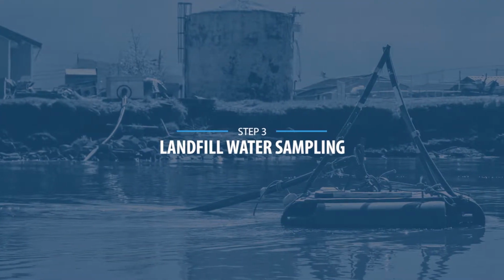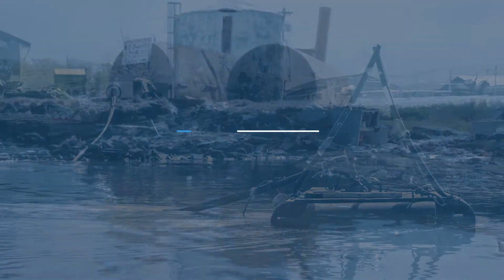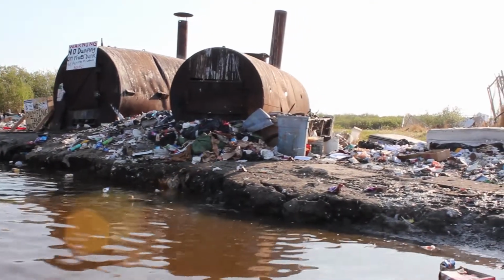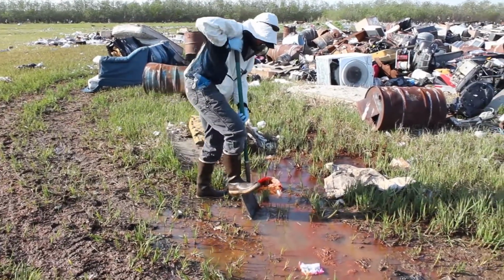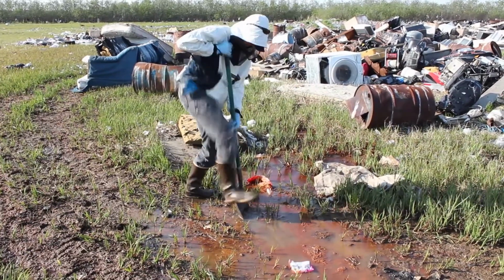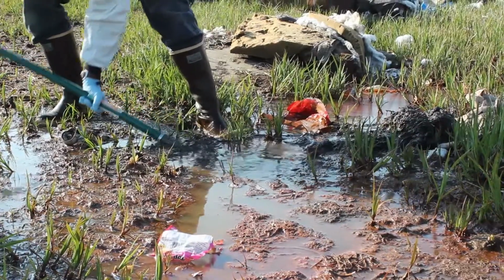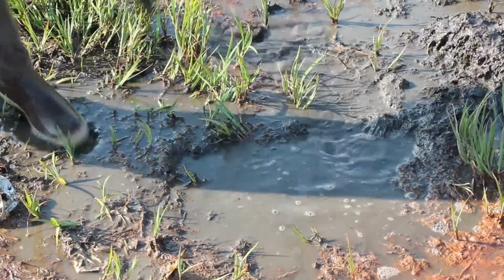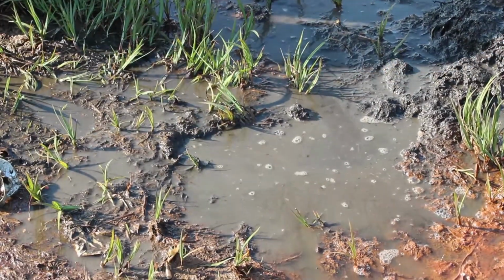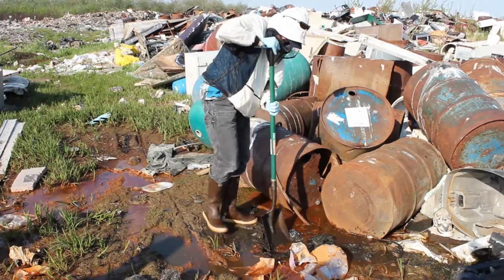Step 3. Landfill water sampling. Once you're back at the landfill, it's time to take your samples. If any of the sample sites are too shallow, you can dig a hole to make them deeper. Of course, this will stir up some sediment, so let the water settle for a while before taking the sample at that location. You might have to repeat this at each sample site.